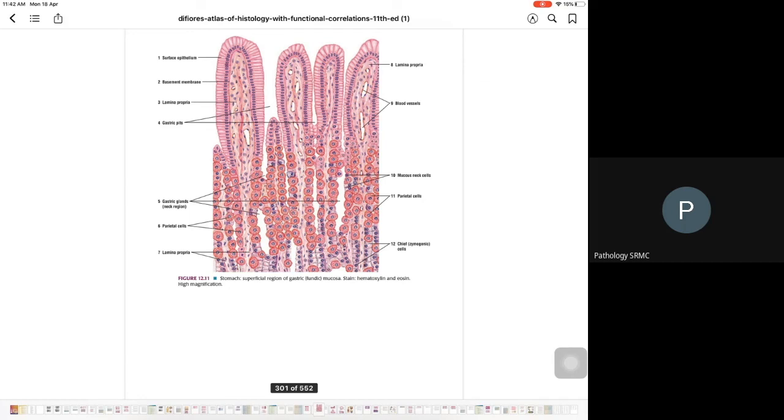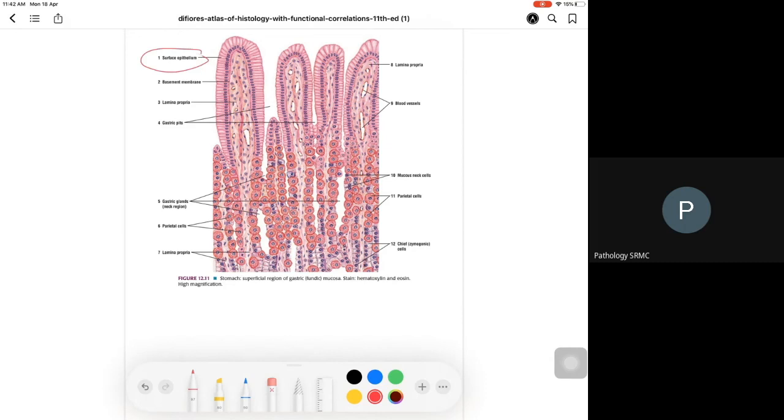We saw the criteria for inflammation. Now I want to tell the criteria for dysplasia. How will you describe the surface epithelium, Abhijit? Uniform size, shape, distribution with a single layer of lining epithelium that are tall columnar with basally placed nuclei and abundant cytoplasm filled with mucin.